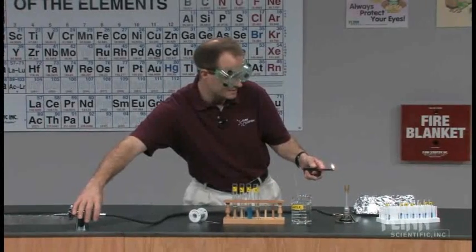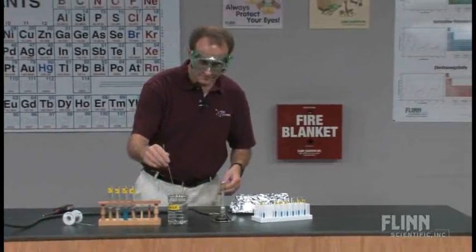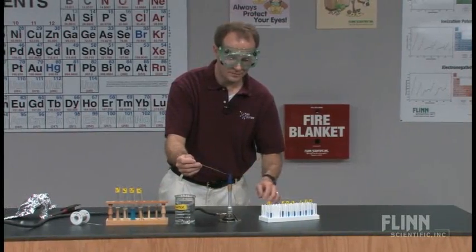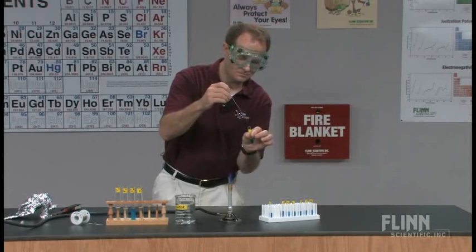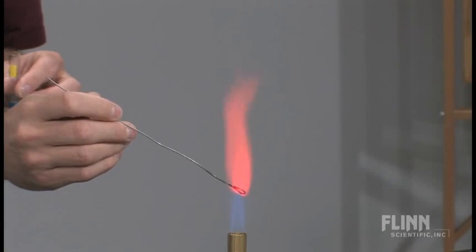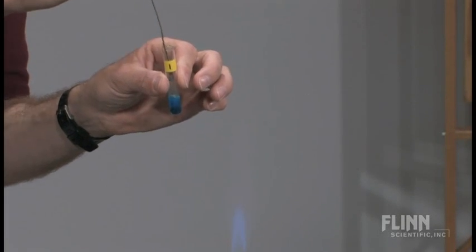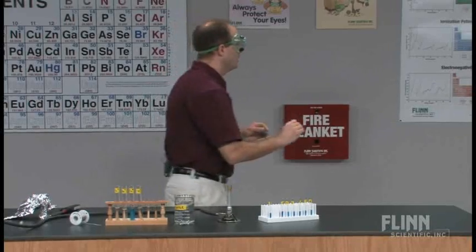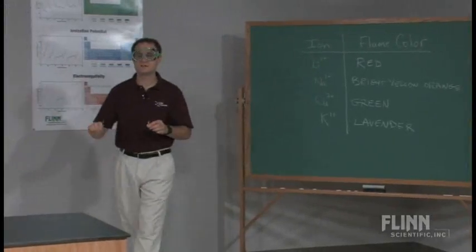Let's try one of the unknowns — test tube number one. Most definitely burning red. Test tube number one must be lithium.